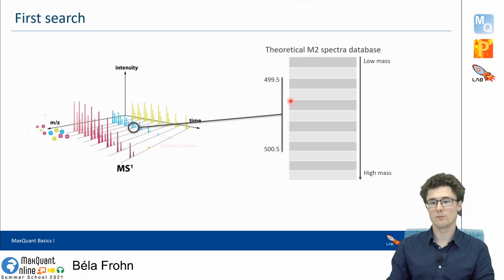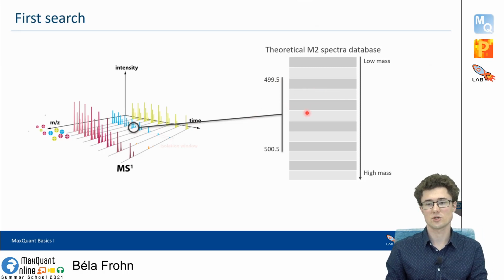And now the important point is that this search in the database is not like the whole database that is searched, because this would take forever basically. But we only search a very small subspace of the database.